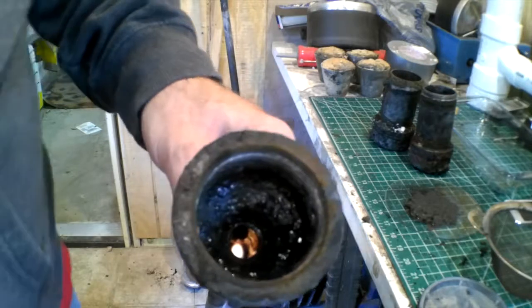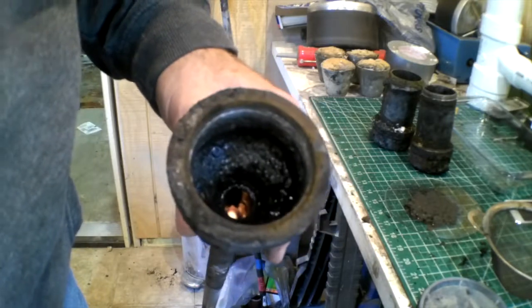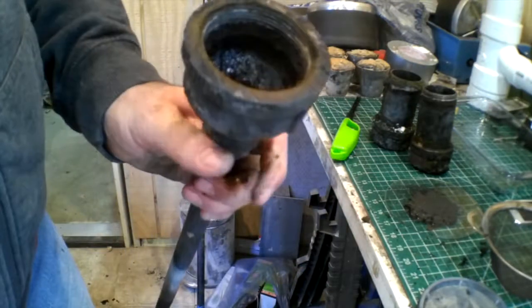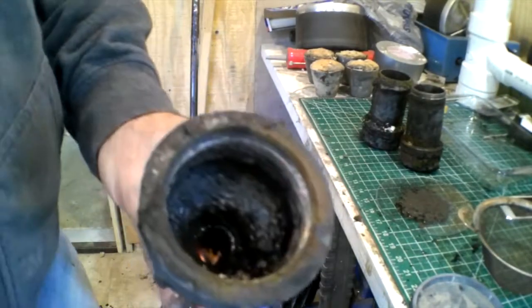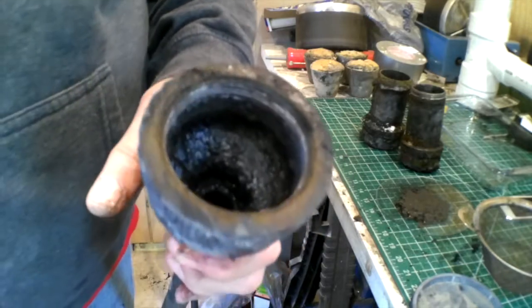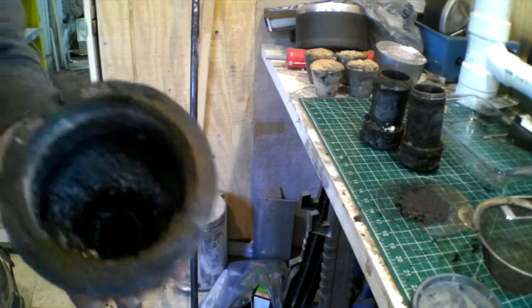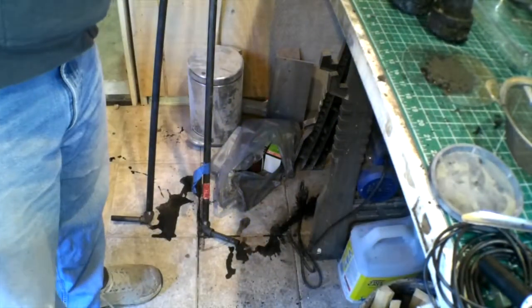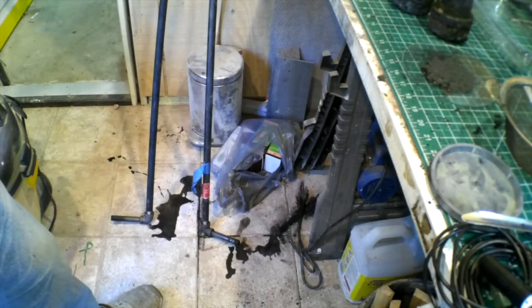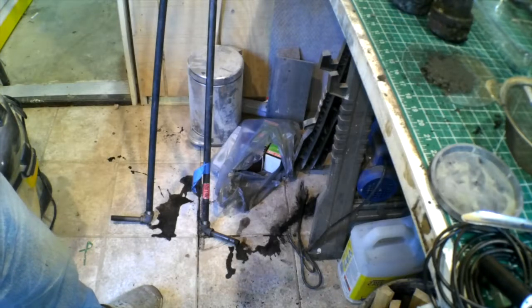Good proof of concept, though. At least it lets me know that I can do it. Apparently I can't do it in recoverable quantities, but I can do it. So that's actually kind of a fun result. I'm glad I did that. I should also tell you this thing's gotten warm, so that should have happened too. That's part of the reaction. Still not done. Still making hydrogen. So I'm going to call that a successful experiment, even though I wasn't able to actually recover the potassium. Obviously I didn't do it with the sodium, so oh well. But look, see, I'm still making flame down there. I'm still making hydrogen. So I did manage to recover metallic potassium out of that reaction. Not enough that I could actually show it, but I demonstrated it. So I'm going to call that one a wrap for now.